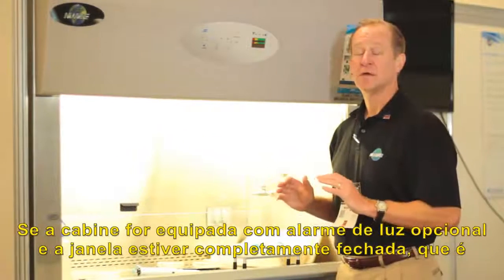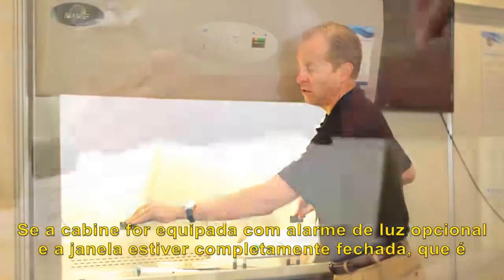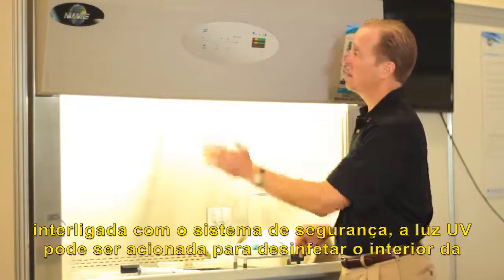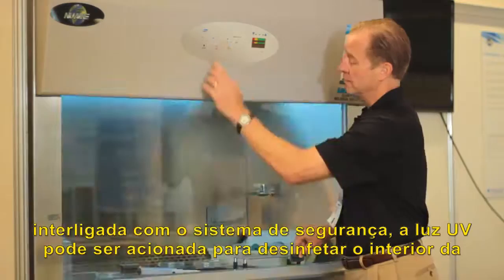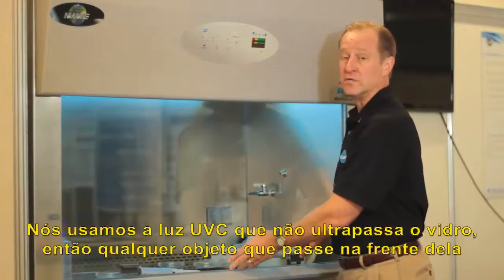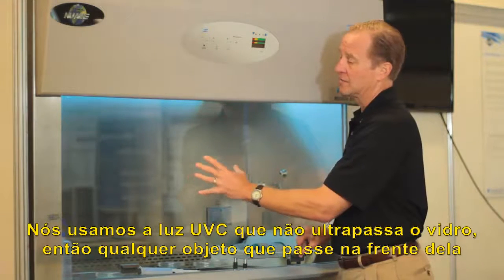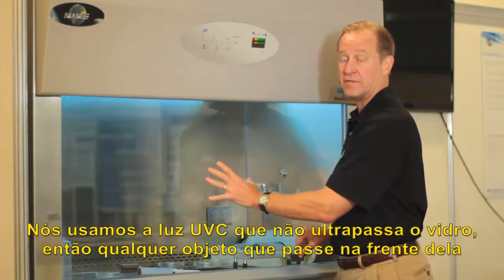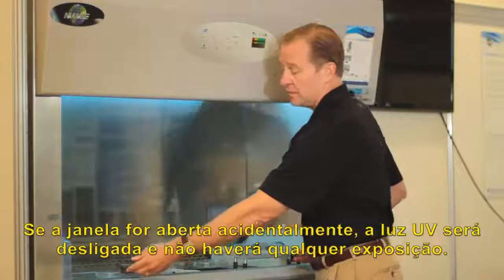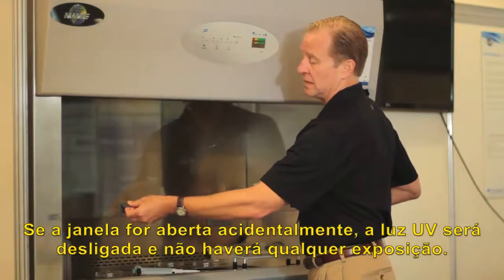If the cabinet is equipped with an optional ultraviolet light, the window may be closed into a full position as it's interlocked with the safety system, and the UV light may be turned on to disinfect the interior of the biosafety cabinet. We use UV-C light, which is not penetrable to the glass, so any object passing through or in front of it is not exposed to the ultraviolet light. If the window is open inadvertently, the UV light is interlocked and no exposure to UV light will take place.